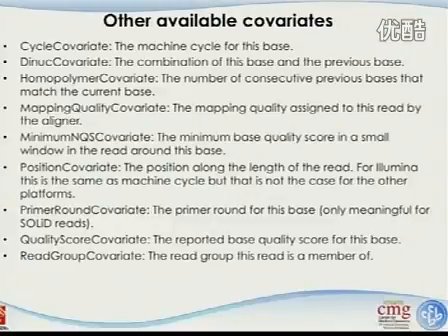Actually, we'll talk about that maybe next time. Maybe I will just send through emails about when we do the homeworks. And in the GATK package, there are pretty established programs to do this, and these are actually the covariates that are included in the GATK package. Okay, if you don't know how to use it, I don't know either. And someone in my lab will know that, which is good.